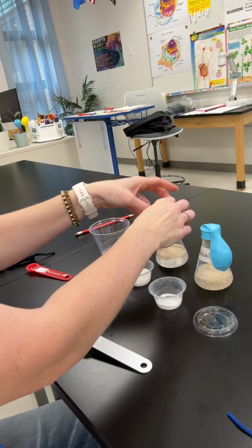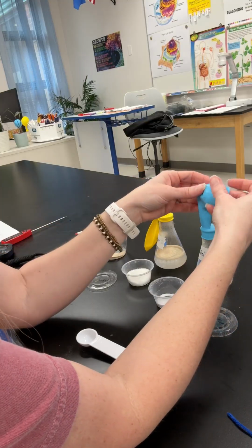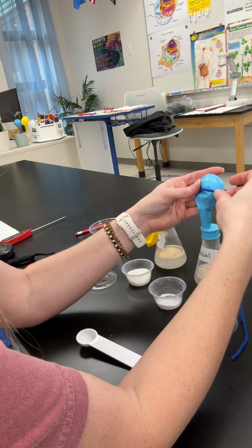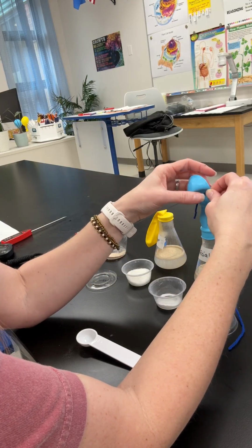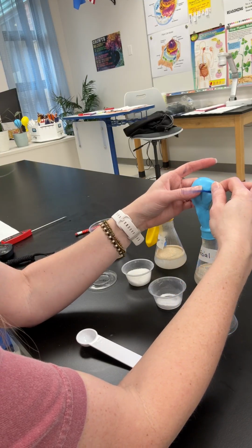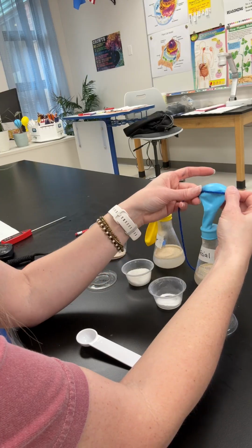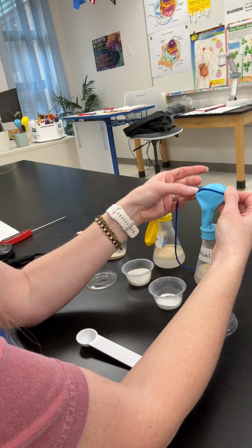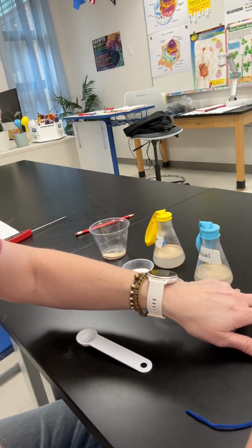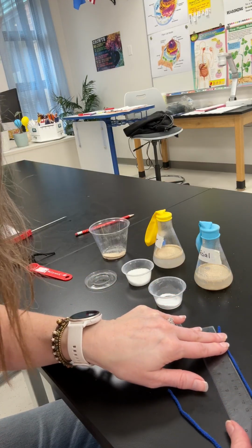Before I mix those up, I'm actually going to do our starting measurement. We're going to be looking at how the circumference of these balloons changes. The circumference is the distance around a circle. Obviously this is a flattened circle right now because there's no carbon dioxide that has been released yet. You're going to be measuring the distance around the balloon. We'll do it in centimeters. My distance around the balloon is 13.